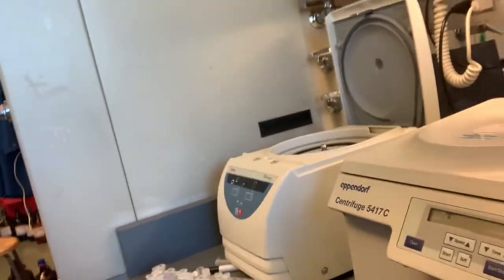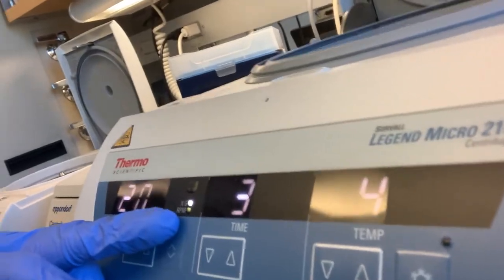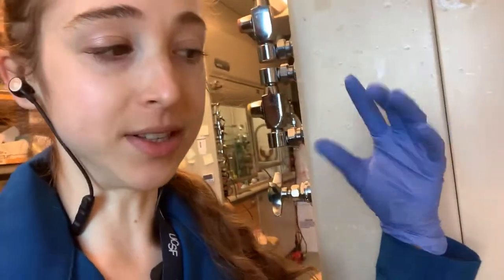Speed can get really weird. On centrifuges you'll often see it displayed as times G or RPM, and sometimes as RCF. RCF stands for relative centrifugal force — it tells you how much force is being applied when things are getting spun down. This is related to the RPM (revolutions per minute) as well as the radius of the centrifuge — how far your sample is from the center.